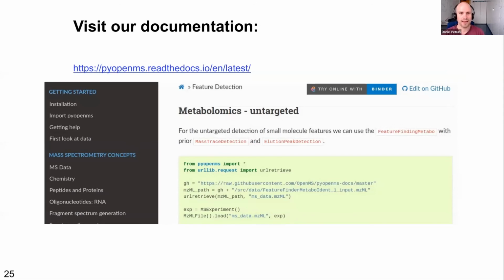The files Efi generated at the end are basically the same files as Robin exported from MZmine. Just instead of MZmine as a feature finding and pre-processing tool, you've now seen how to do it with pyOpenMS, in a scripting way, so less with the graphical user interface.